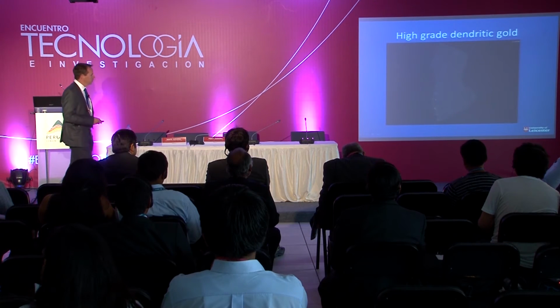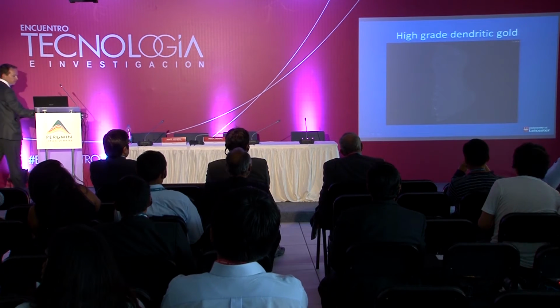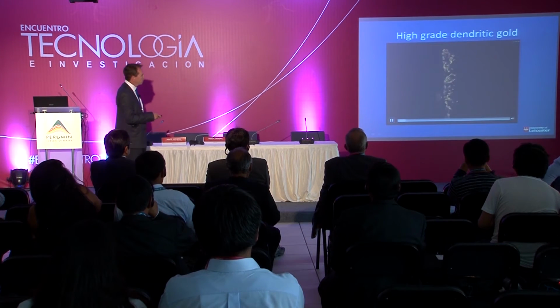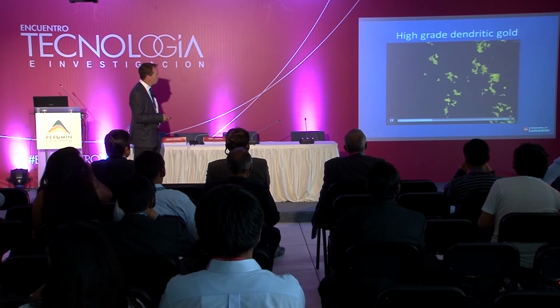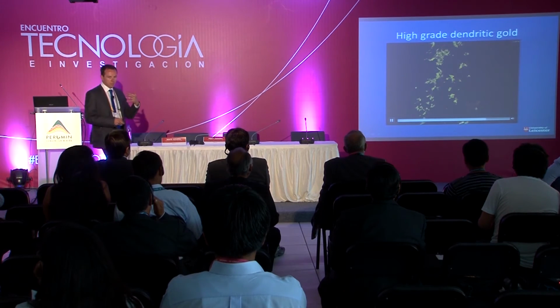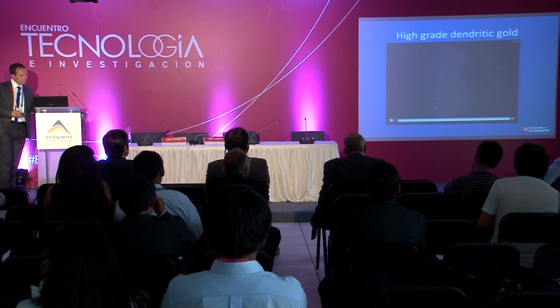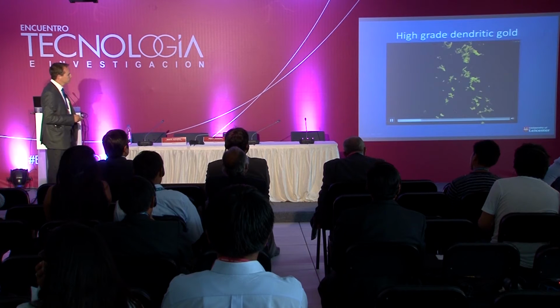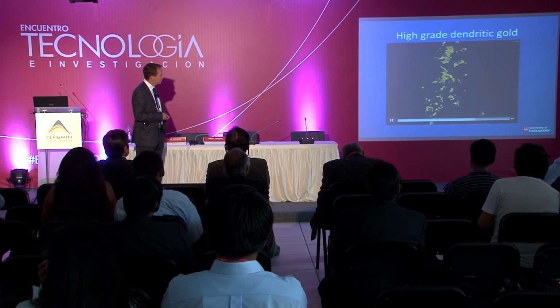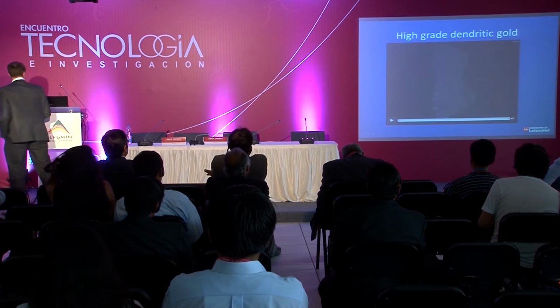This one's quite a spectacularly high-grade sample, and this shows a dendritic style of gold. We'll take away the sulfides there, we'll zoom in a little bit. That's the edge of the vein there, and you're able to see that gold growing into that vein. I'll just do that again. There it is. And the brown there is some pyrite, which is also in that quartz vein.